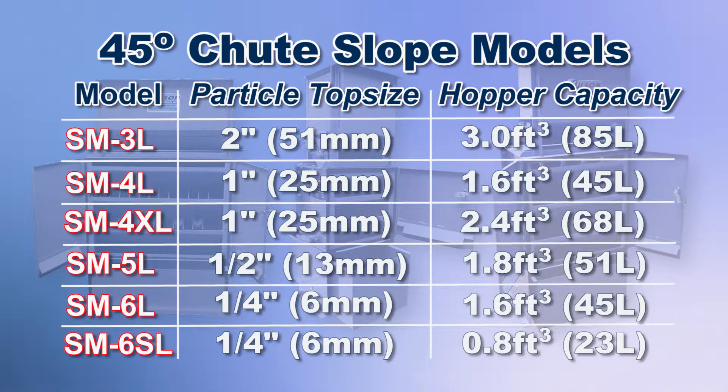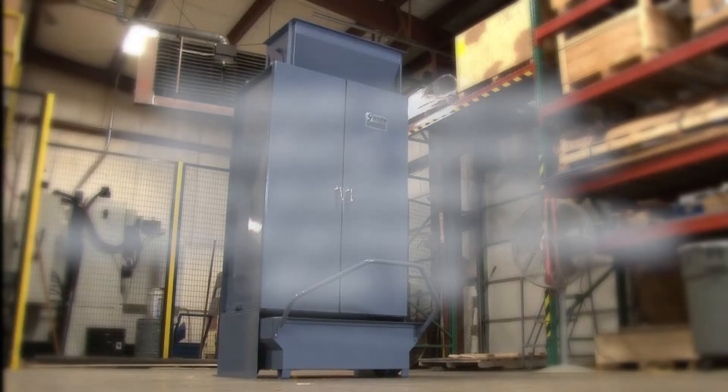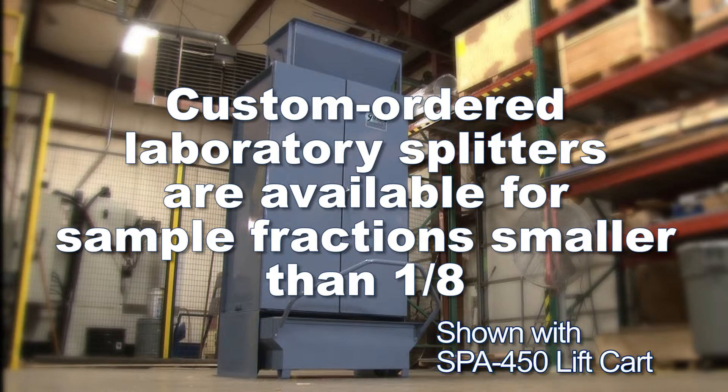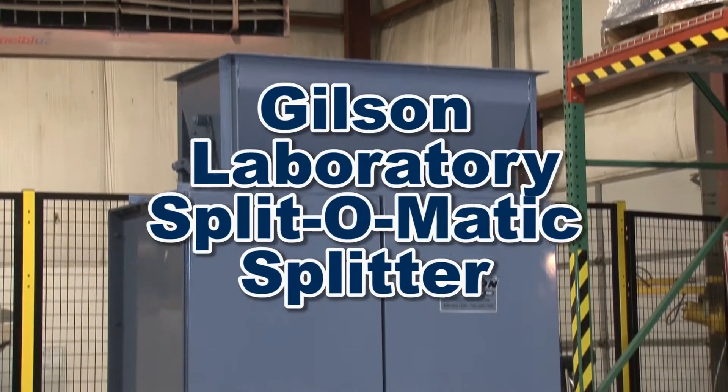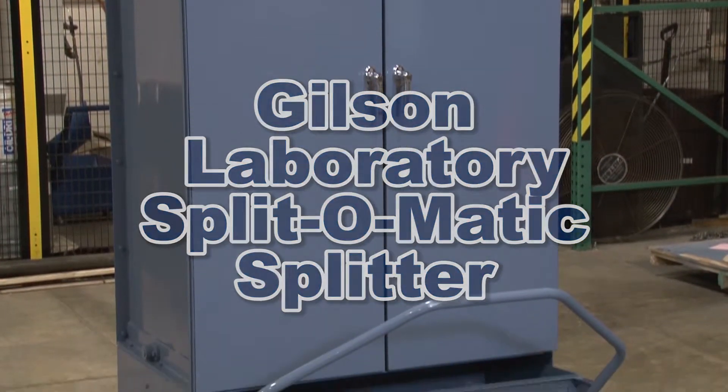Gilson offers multiple Splitmatic splitter models that are well-suited for aggregates or many other free-flowing granule materials. Custom-ordered laboratory splitters are also available with four or more chute stages for sample fractions smaller than one-eighth, making the Gilson Splitmatic splitter the right choice for your materials testing lab.